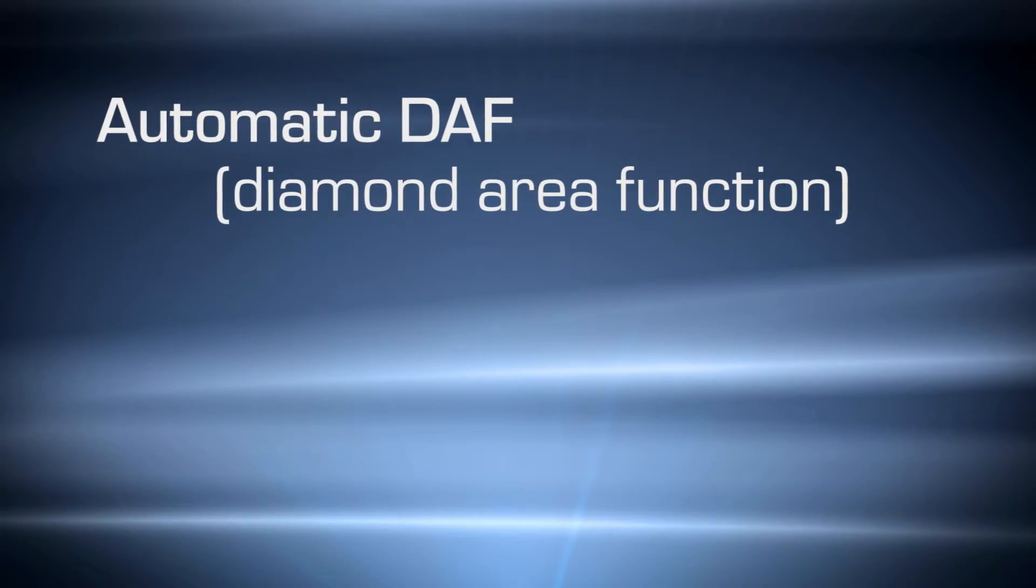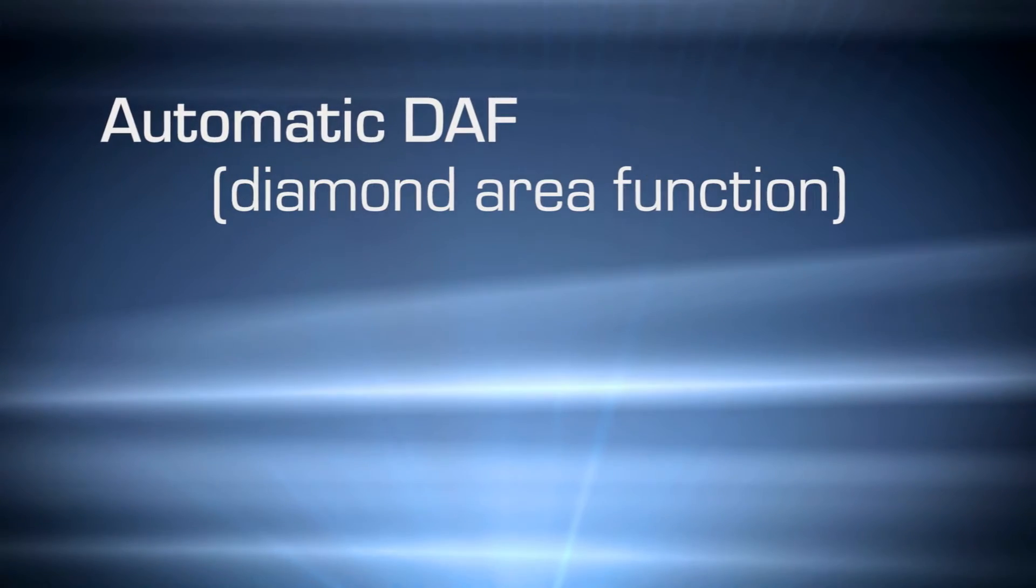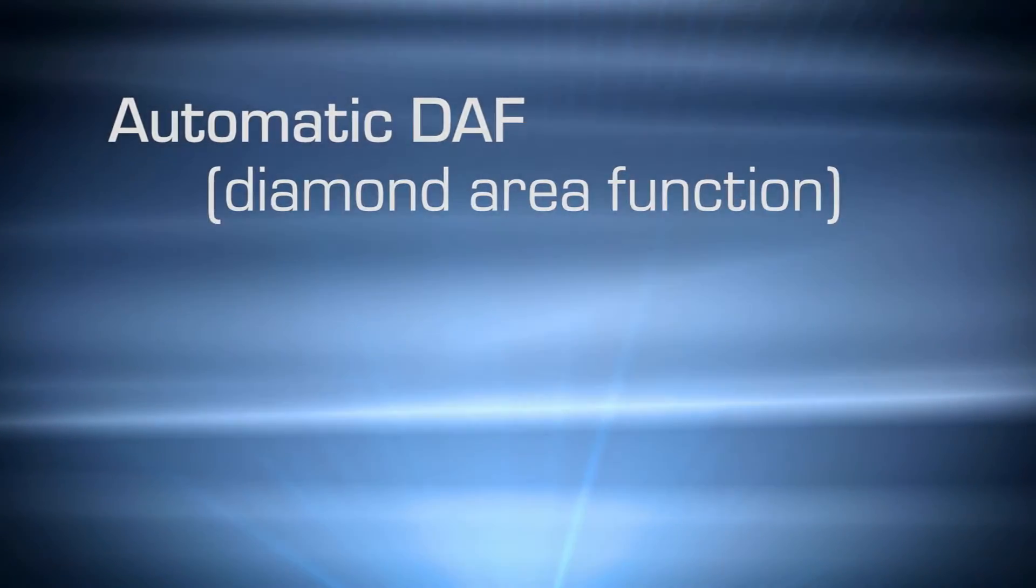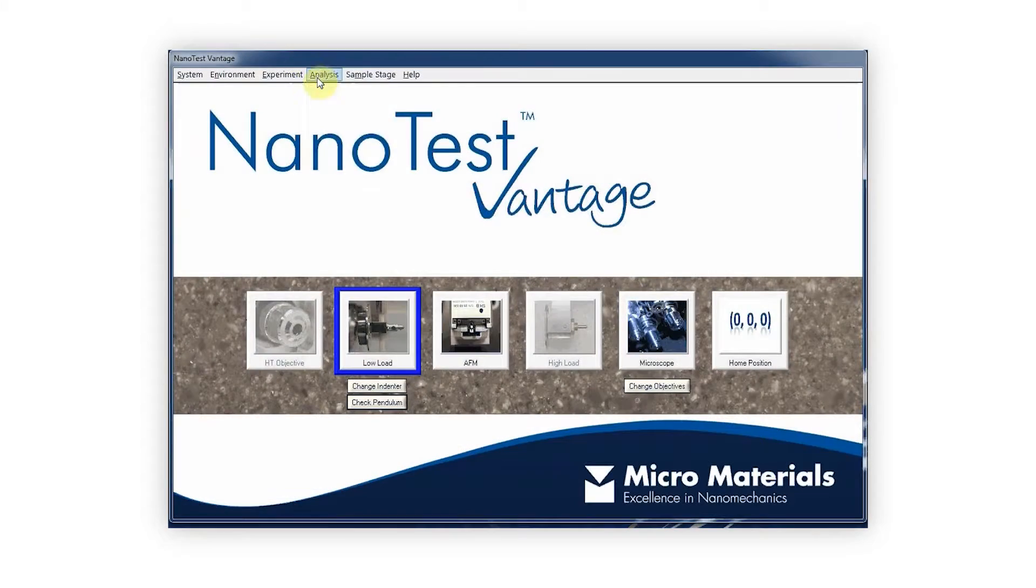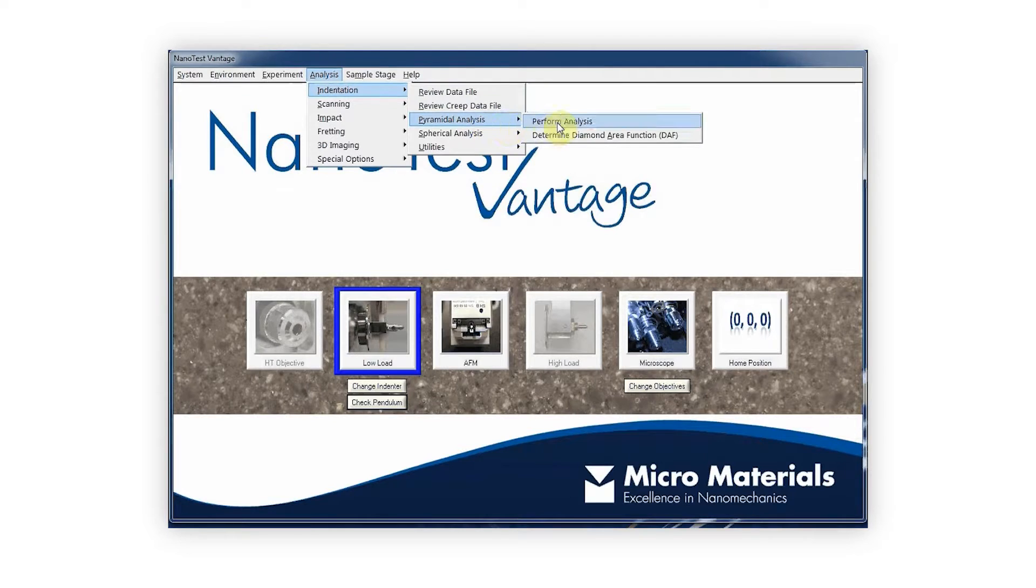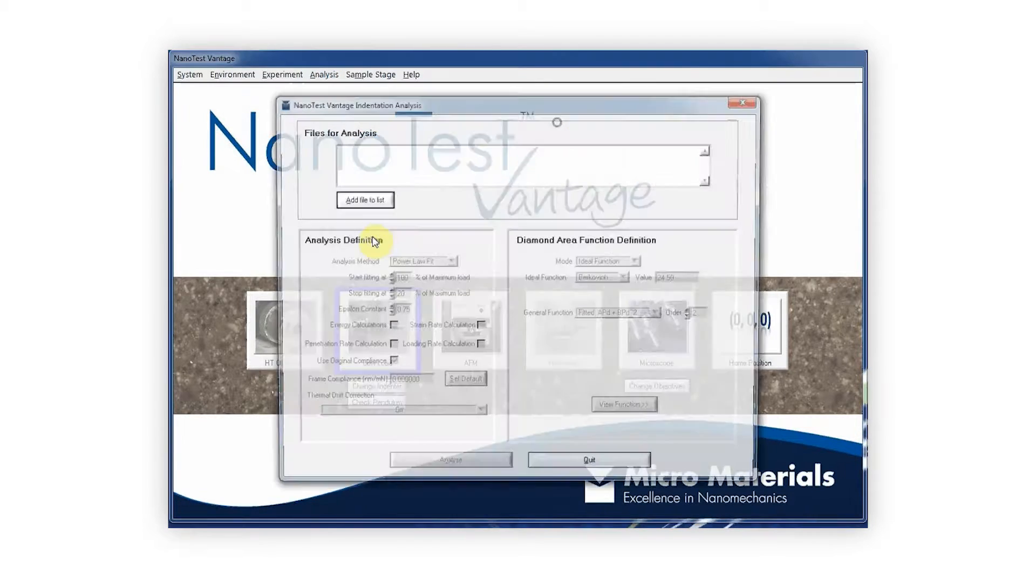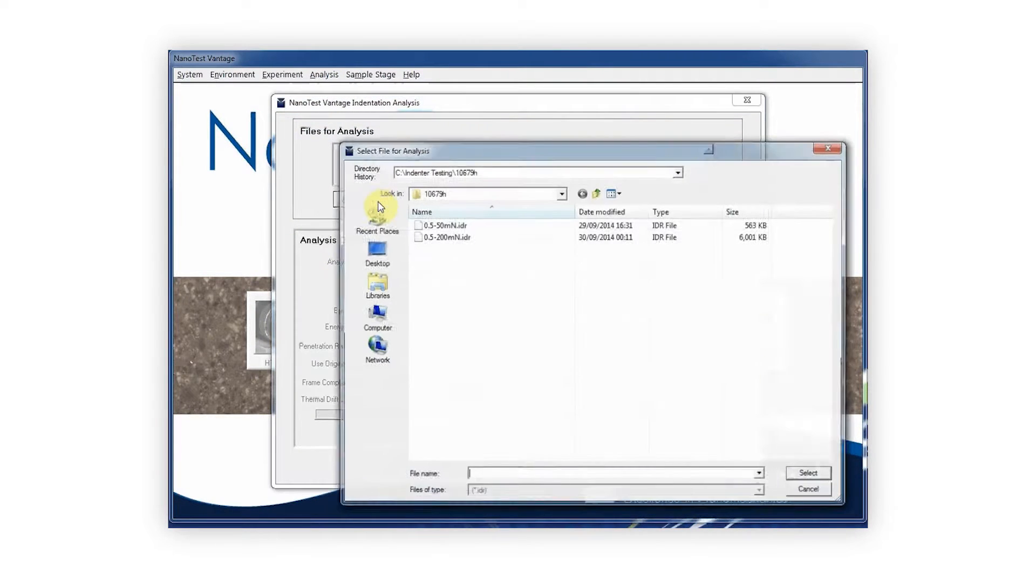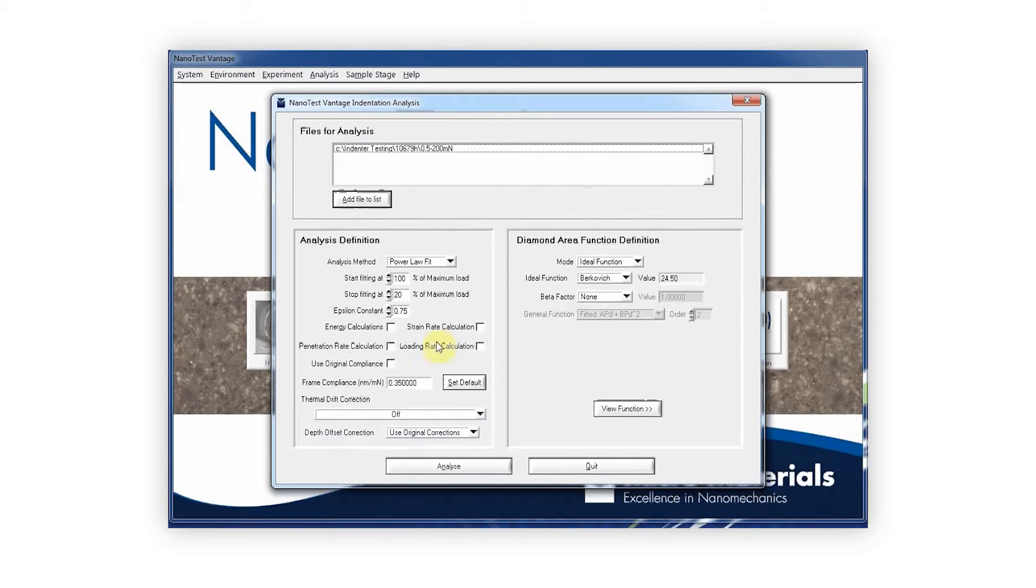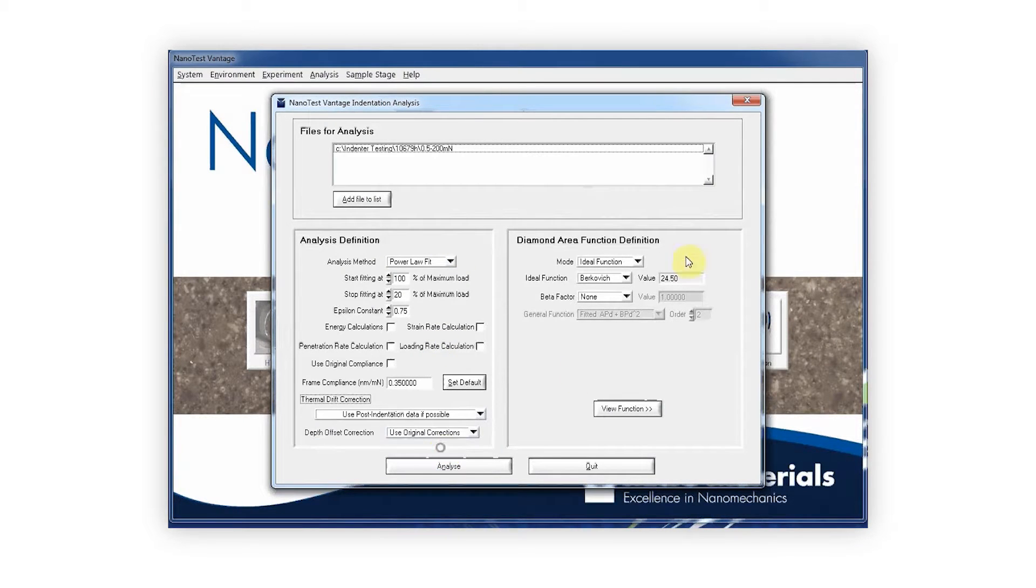Indenter area functions are of critical importance for accurate analysis results. Area functions are most commonly obtained by performing indentions on a reference sample. The NanoTest software makes it quick and simple to perform this calibration.